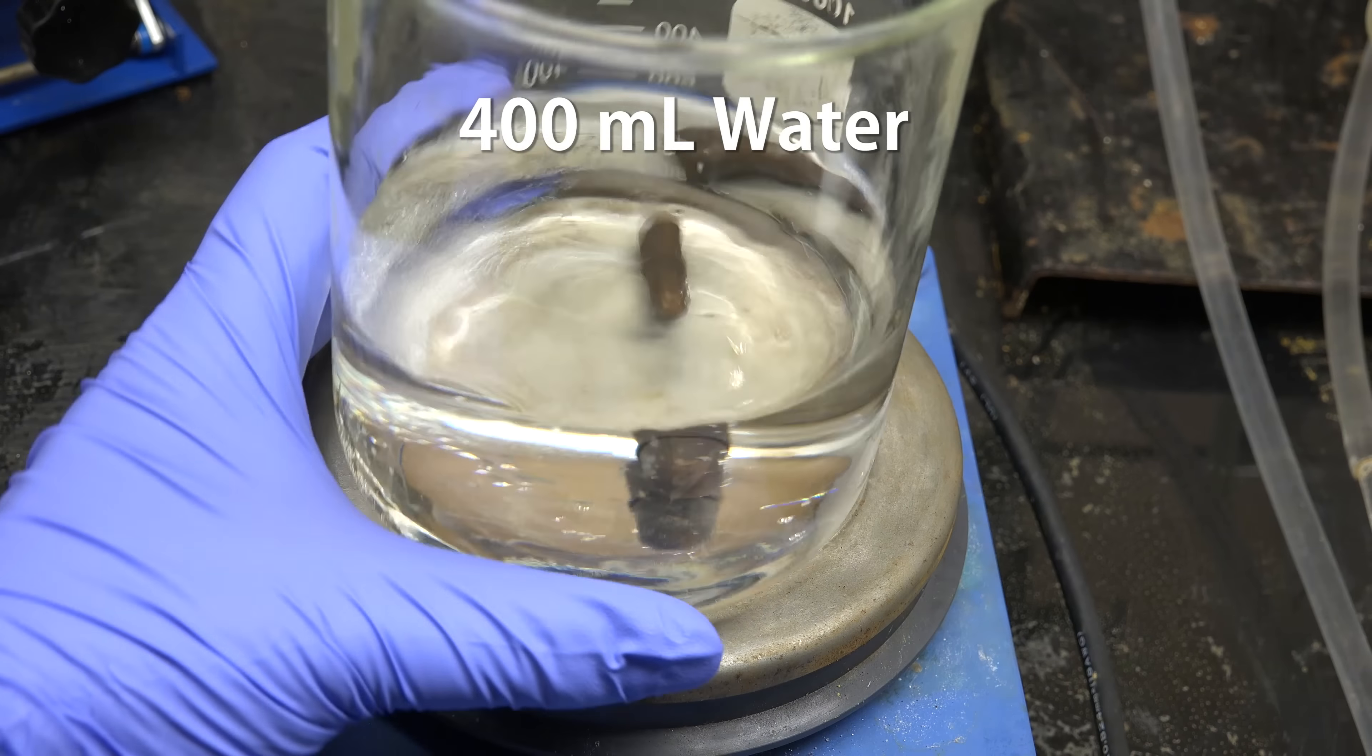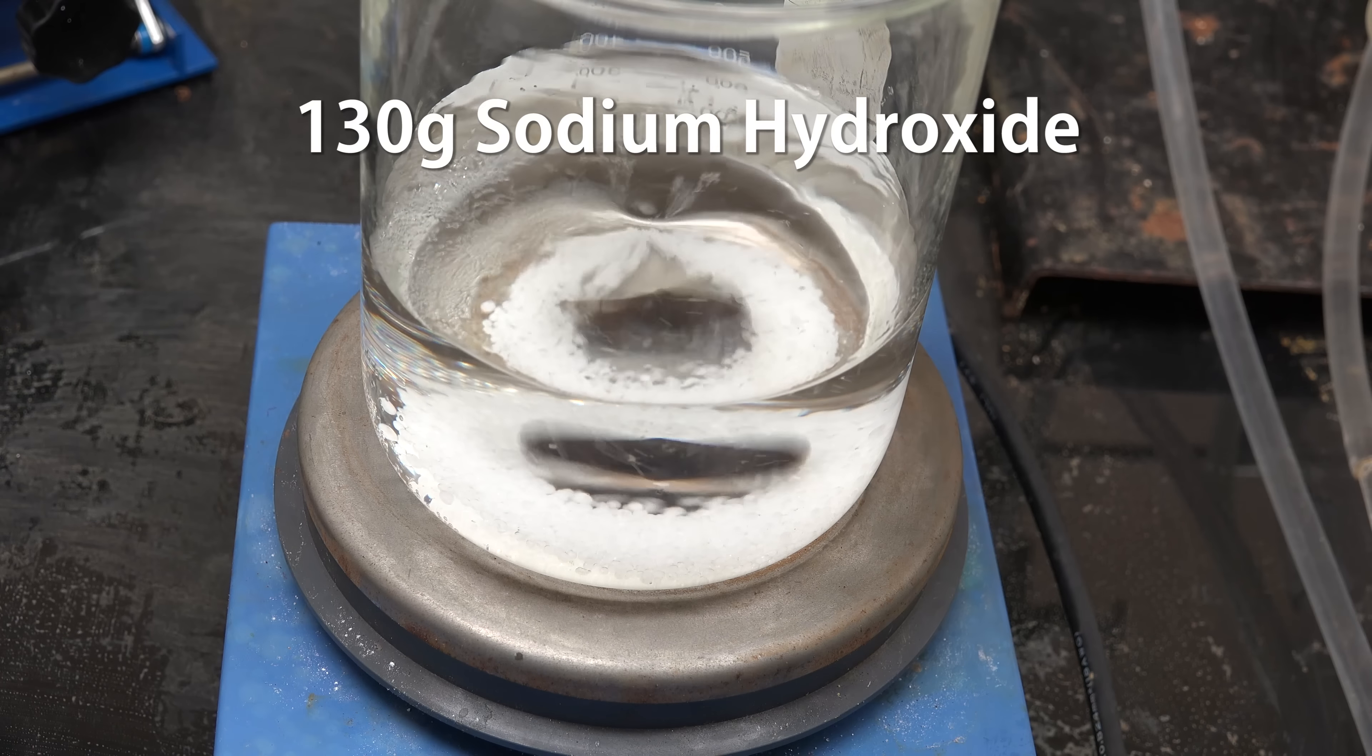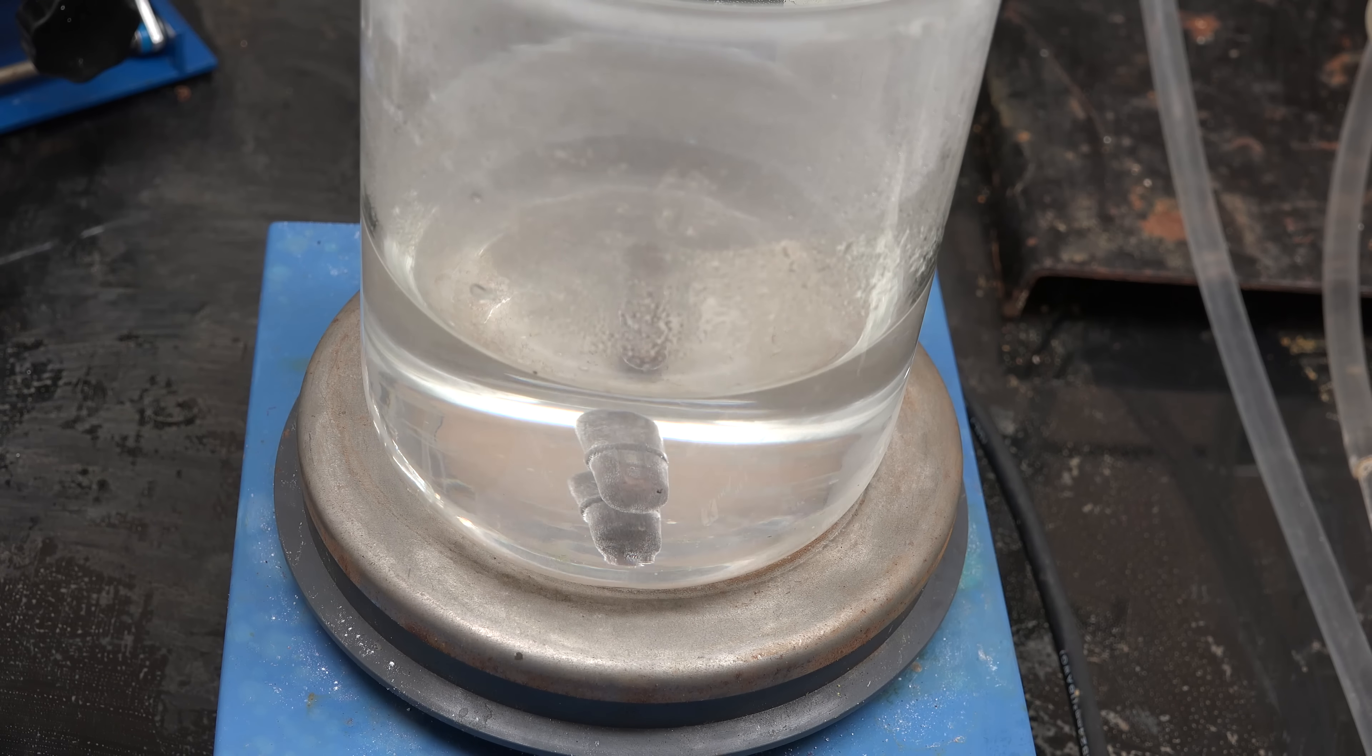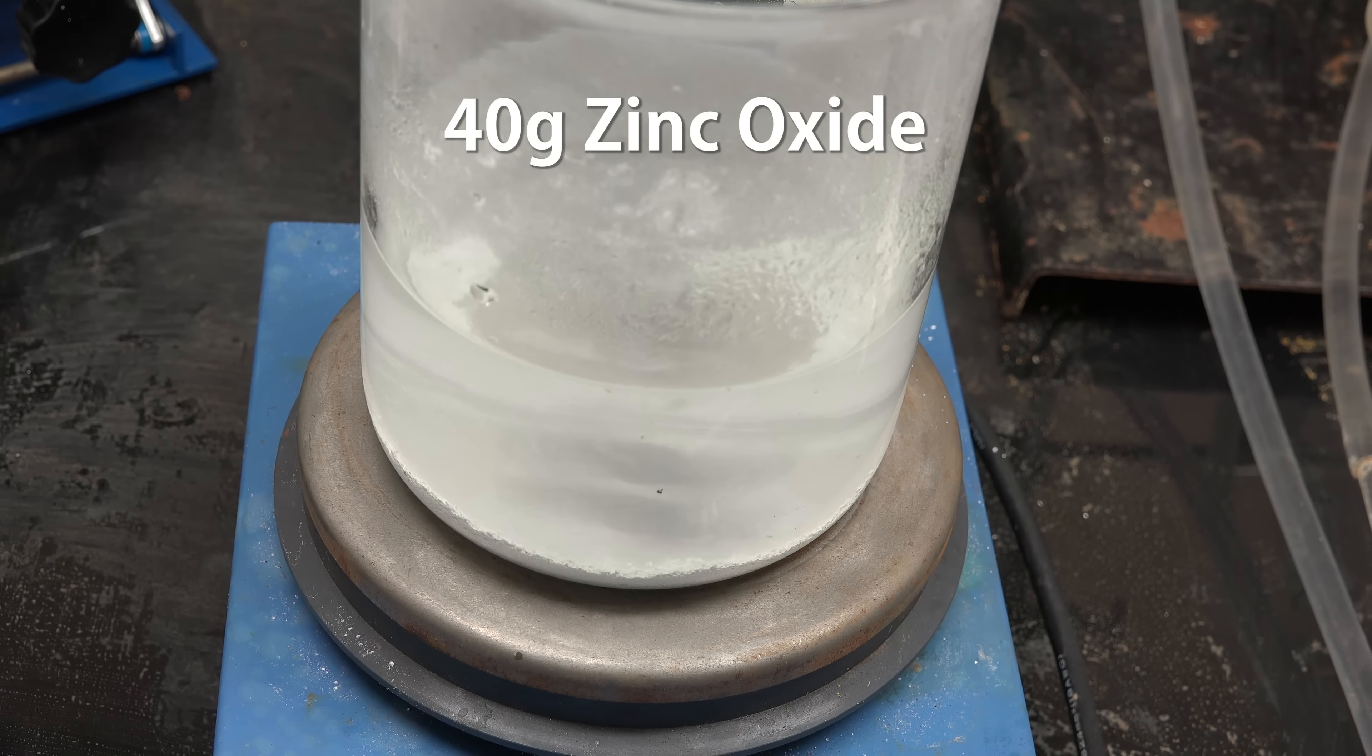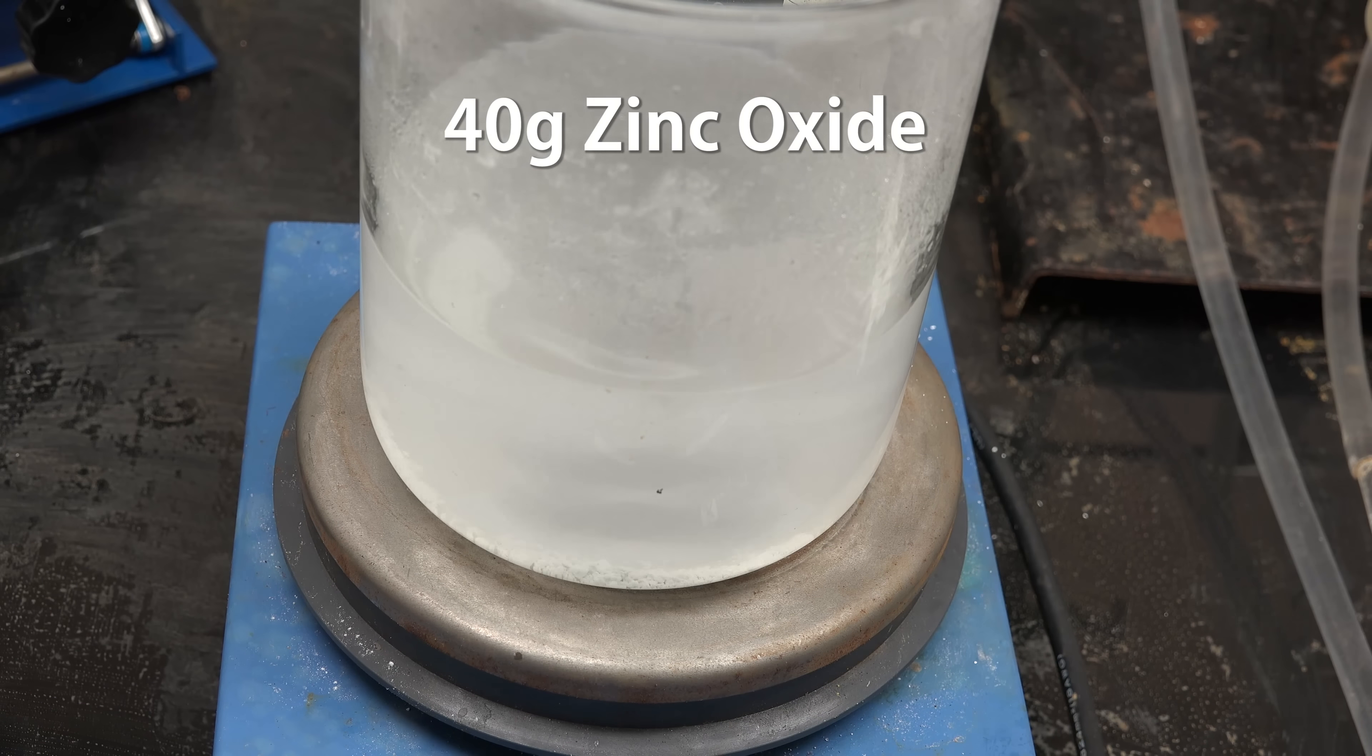Start with 400 mL of water and add to it 130 g of sodium hydroxide. Stir it until it dissolves. Now add zinc oxide until it stops dissolving. I add about 40 g in two 20 g portions.